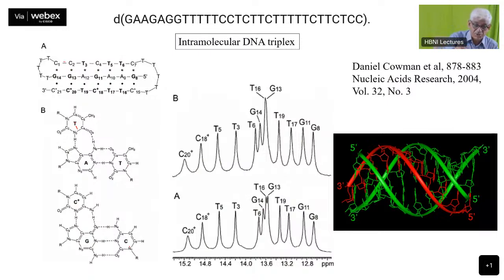So this is the particular duplex stem. This CC, TC, TTC, and G8AG, this stem here. The 5' sequence goes like this. Ideally one would have started saying, okay, 1 here and things like that, but they will represent in this manner to conveniently show the base pairing schemes there. So it goes like this. The DNA sequence goes like this, takes a loop, then comes like this, then takes a bigger loop, then comes like this and goes here.